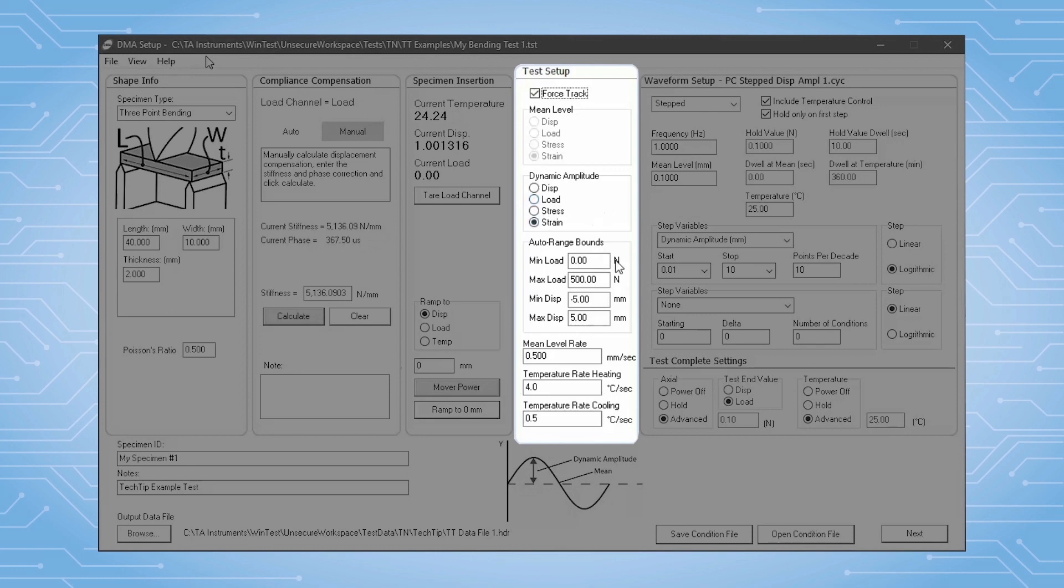Another control feature is auto-ranging. Here we can define the bounds in which we allow the adaptive controller to operate.